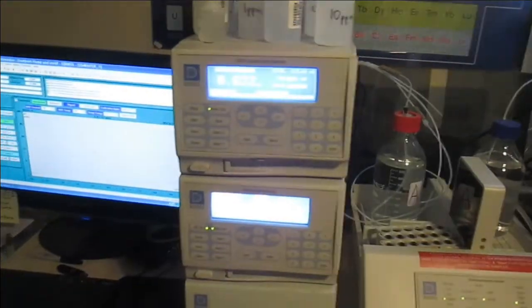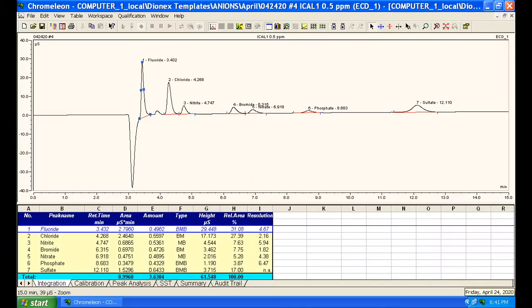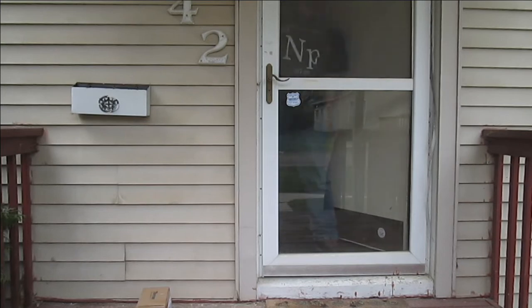Hello and welcome. On the first episode of this Analytica video, I analyzed a few water samples for anions and complained about a part I needed to complete the cation side of the ionic makeup of my samples. So the delivery finally happened, and I was able to finish this long overdue cation video.